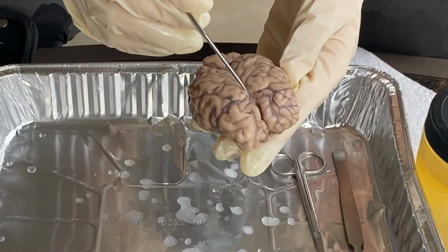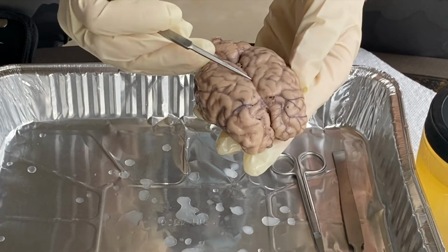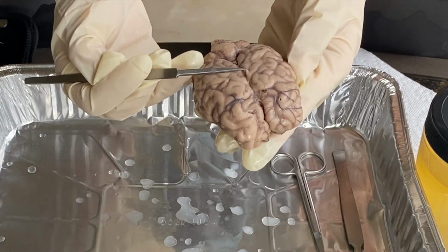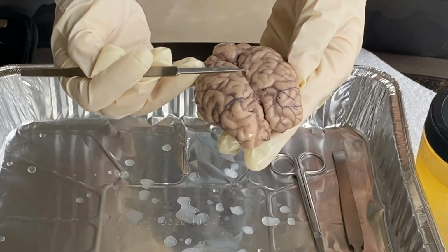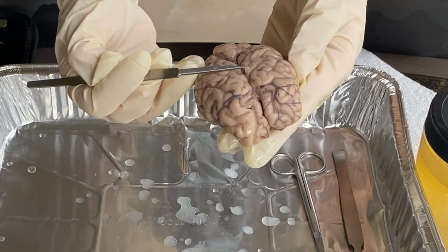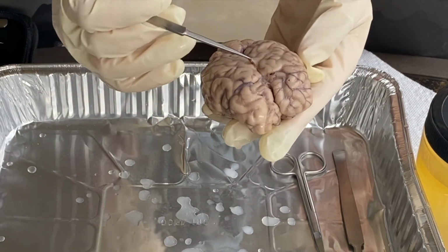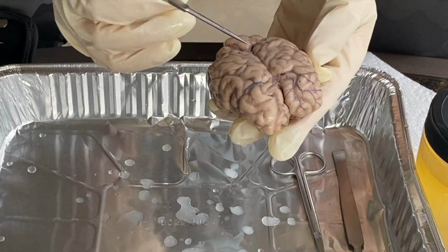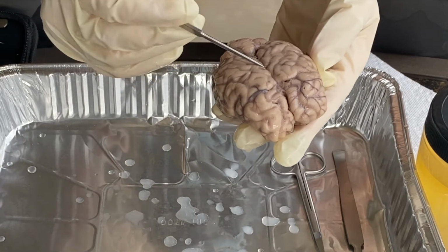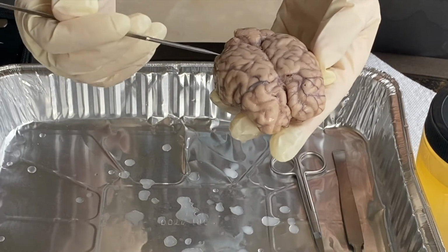So the innermost layer of the meninges is the pia mater, and it's this very thin layer right here that just coats the brain, and it serves as a protective layer, one of the 3 protective layers, the innermost one being the pia. And it's a protective layer which prevents the blood and other unwanted substances from getting in contact with the brain tissue.